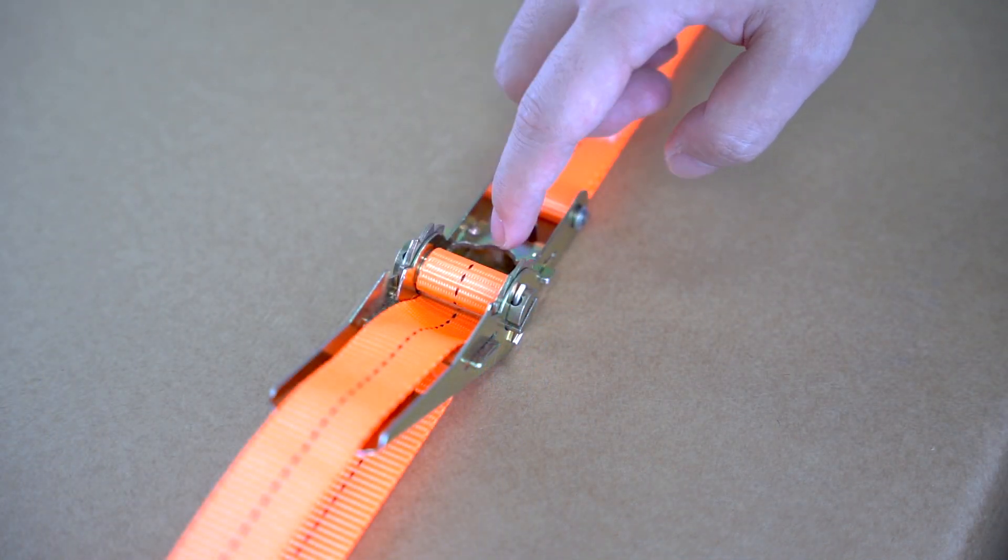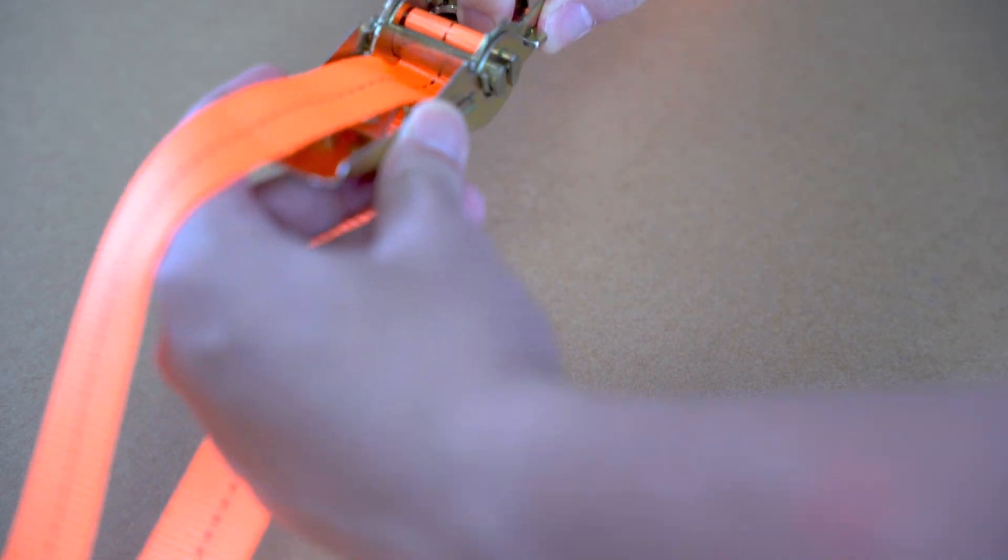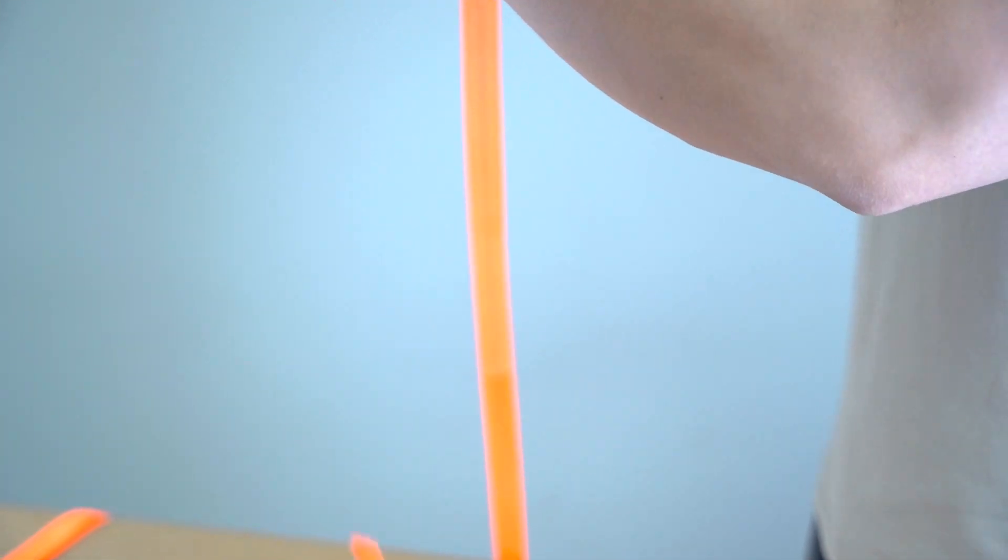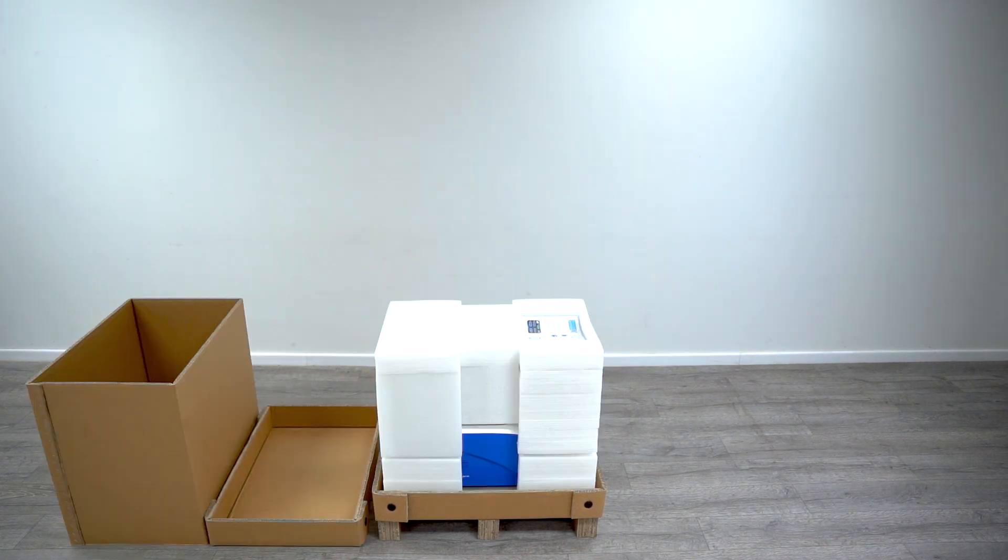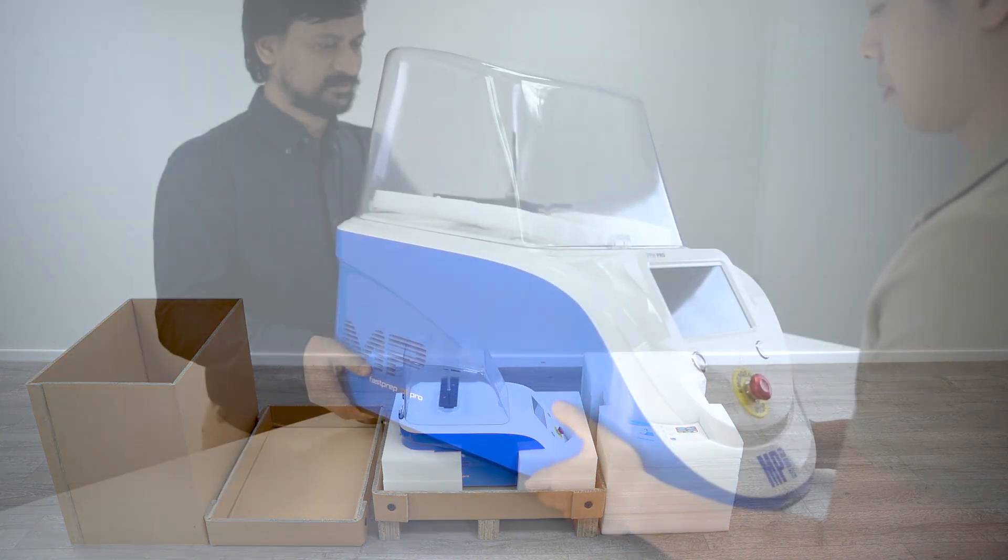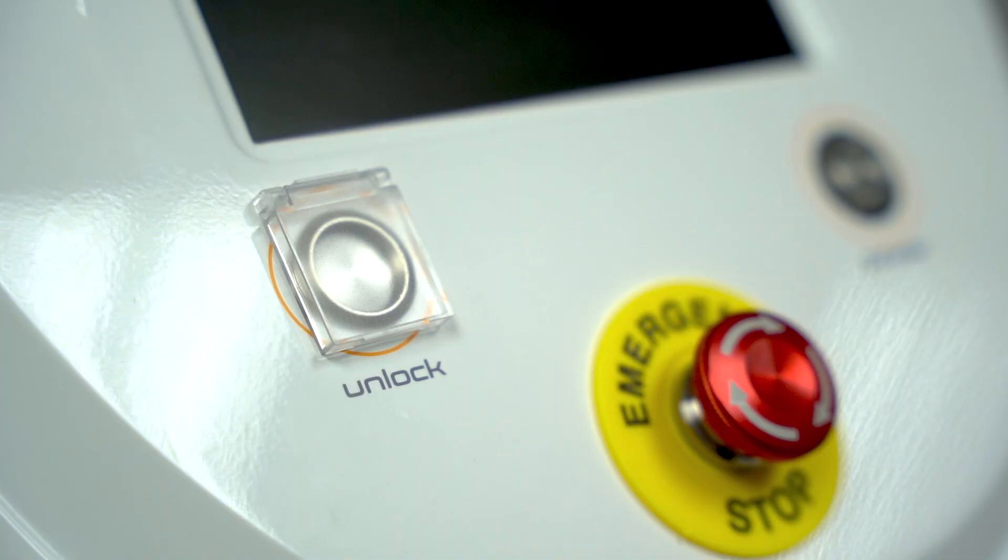Then slide the loose end of the strap out of the ratchet assembly and remove the strap from the box. Carefully open the box, remove the top cover, side sleeves, and foam packaging. With two people, lift the machine from opposite sides and place it on a stable, clean table.